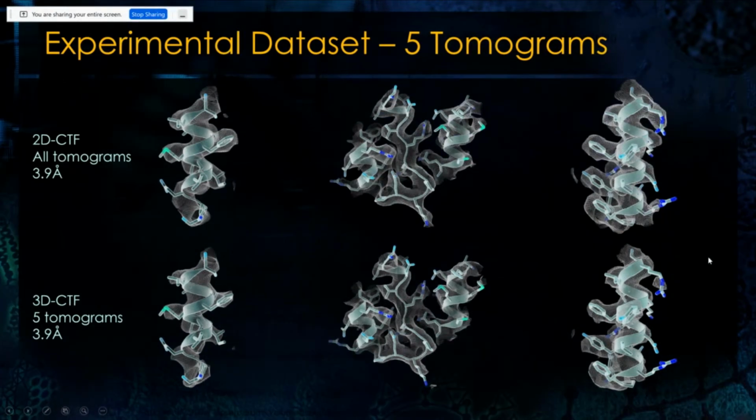And some details here got a bit lost, but some of them actually got nice, like here. So we could see that all these features that were crucial for this 3.9 were also there. Some were even nicer, but the map was definitely a bit more noisy.